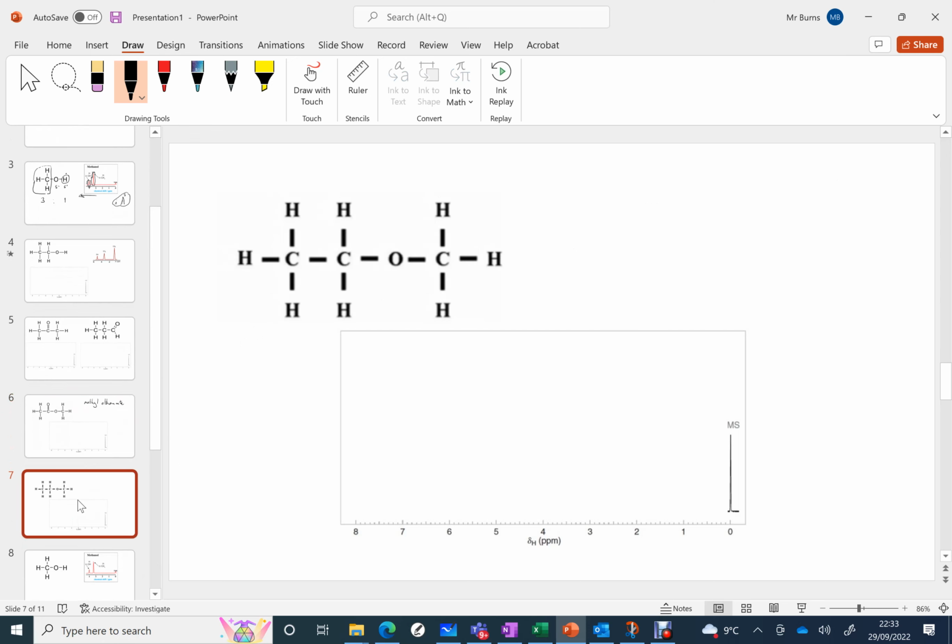And last but not least, there is a wee family in here. We'll get to naming them later. I'll just tell you that that is an ether with that typical look of the ethers with an oxygen but it's bonded between two carbons. So you can go again and have a wee look at that.